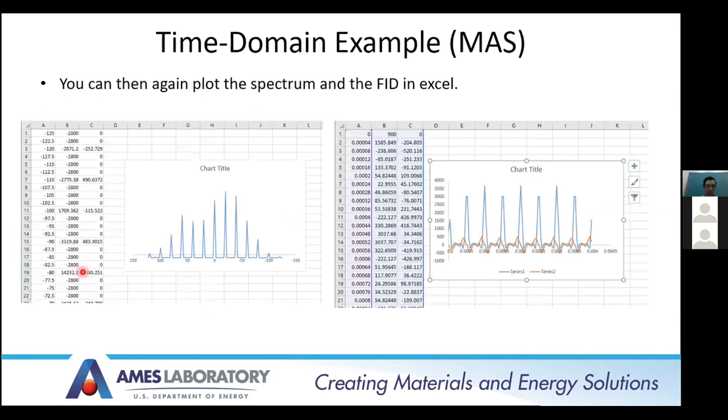So if you open these files in Excel, you'll get this magic angle spinning spectrum here, showing the spinning sidebands for this CSA powder pattern. And you can open the FID file as well, where you can see what the FID looks like.